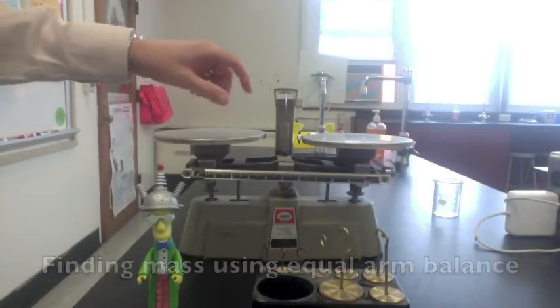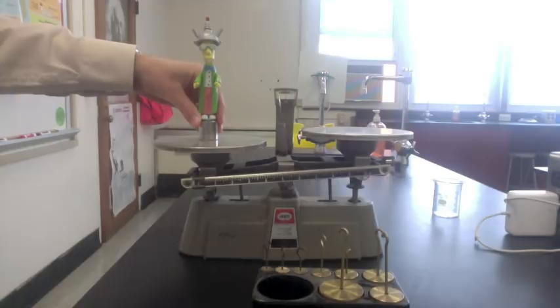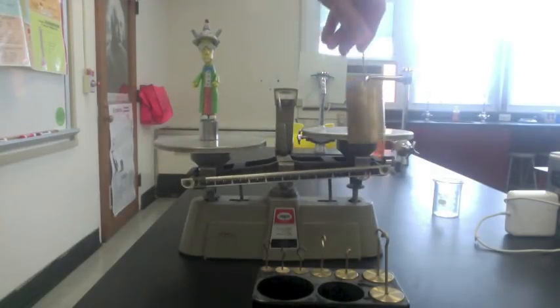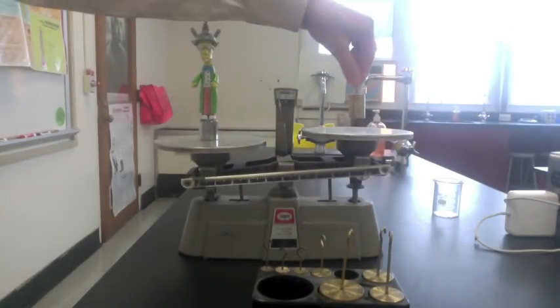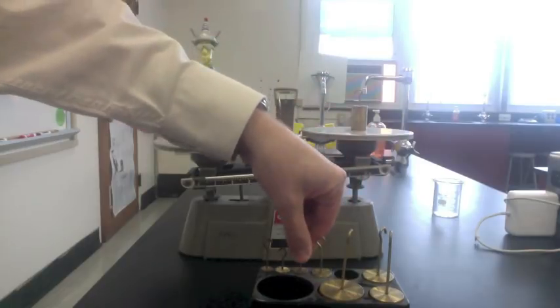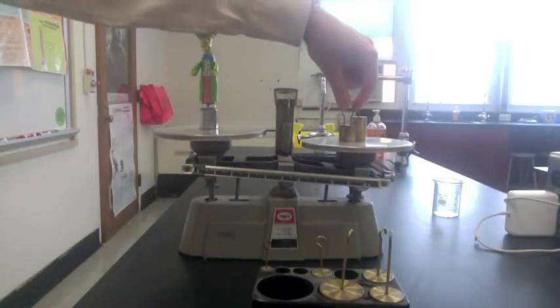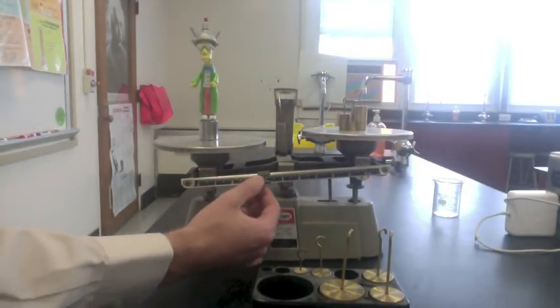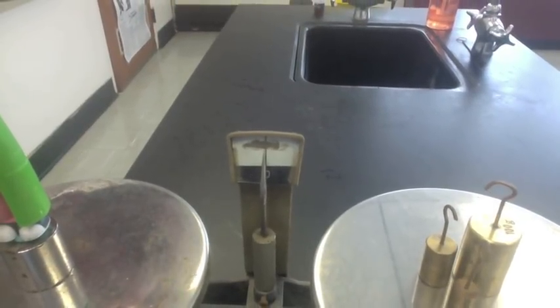Finally, we can use an equal arm balance. This scale has a pointer in the middle and you're going to balance out both sides. Put the object on one side in the center of the pan, and place known masses on the other side. 500 grams is too much, so try 200 grams — again, too heavy. Put on 100 grams; not enough, so add 50 grams. 150 is too much, so replace the 50 with a 20. 120 is not enough, so add another 20. 140 is too much, so add a 10. 130 is not enough, so use a small rider and slide it out until it just balances. Then add everything up: 138.6 grams.